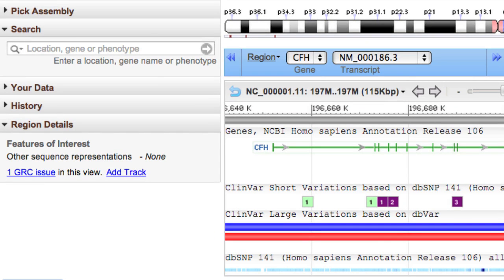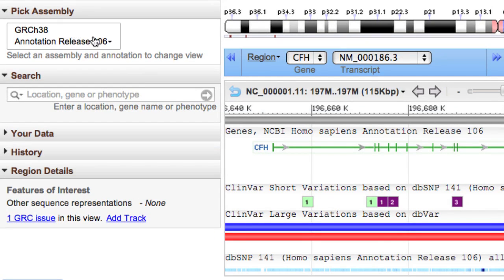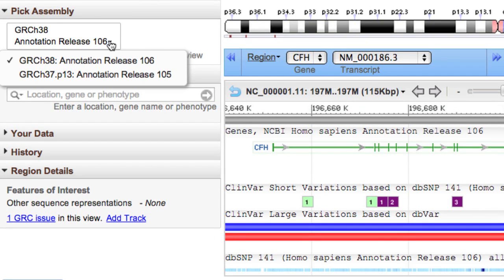I'll start with the search function. Notice that you can choose between the current human assembly, GRCh38, and the previous assembly, 37 patch 13.